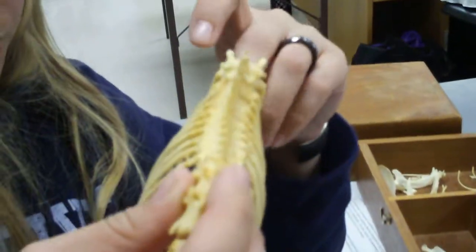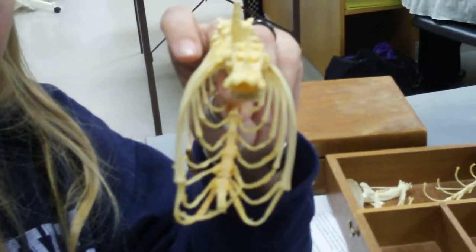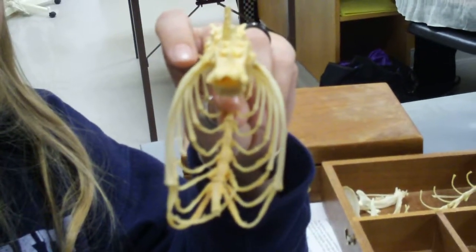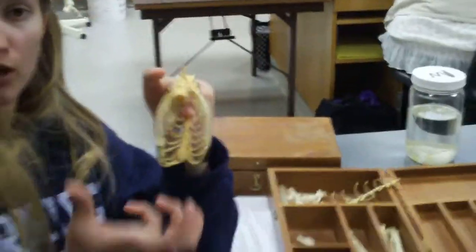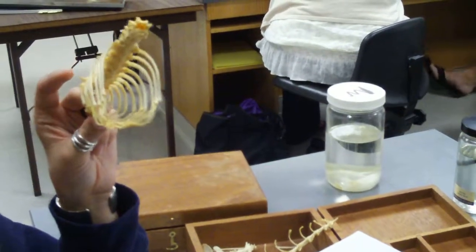You should know the number, how many there are of each of these. All those things. Also in the box, if you look at it, there are some more parts to the vertebrae labeled. You should know those.